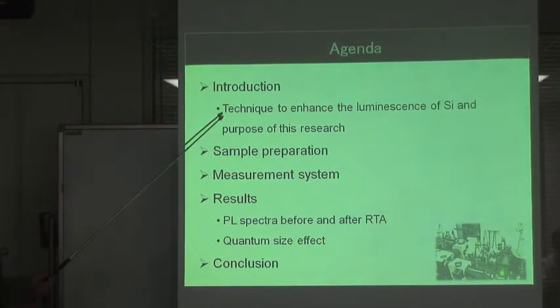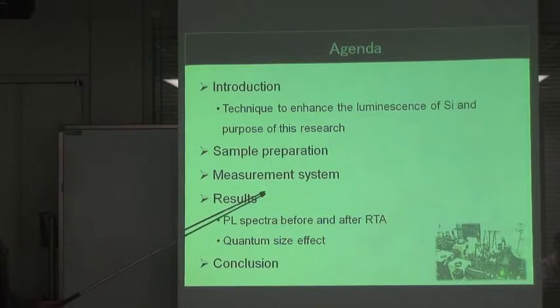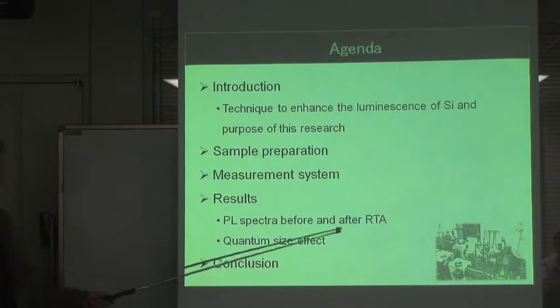First, I would like to talk about the techniques to enhance the luminescence of silicon and the purpose of this research. Then I move on to the sample preparations, measurement system, and results. In results, I would like to talk about the photoluminescence spectra of silicon germanium silicon nanocolumns after rapid thermal annealing and its quantum size effect. And finally, I would like to conclude my presentation.